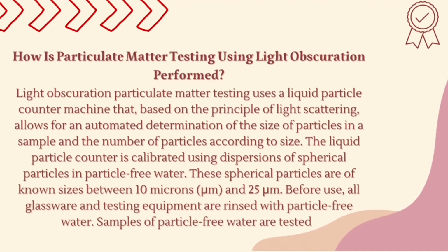The liquid particle counter is calibrated using a dispersion of spherical particles in particle-free water. These spherical particles are of known size, between 10 micrometers and 25 micrometers. Before use, all glassware and testing equipment are rinsed with particle-free water.